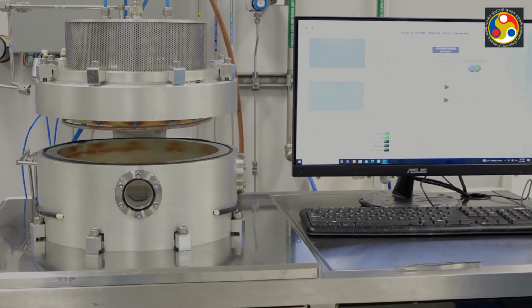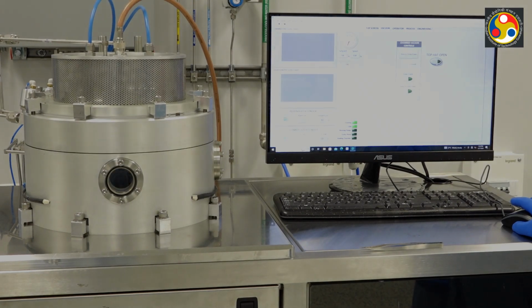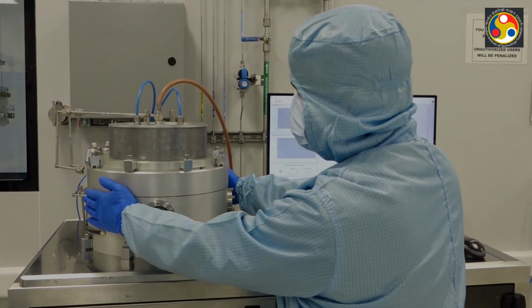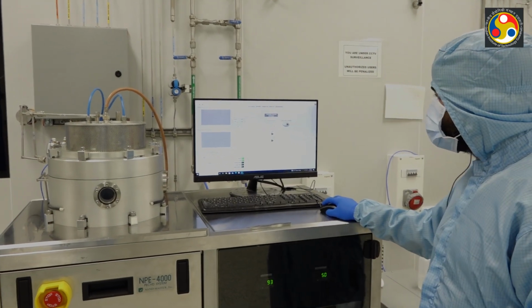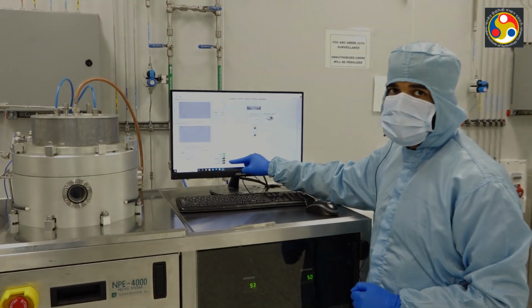Now I am going to close the chamber. Ensure the chamber is properly closed, no mismatch or leaks. Yeah, it is properly closed. Now I am going to pump down. See, the backing pump and turbo pump are in off condition right now.